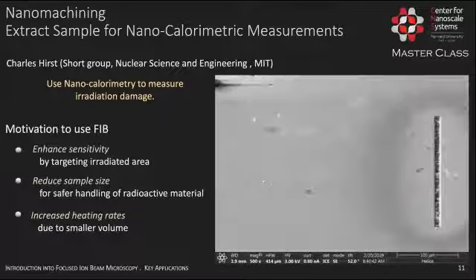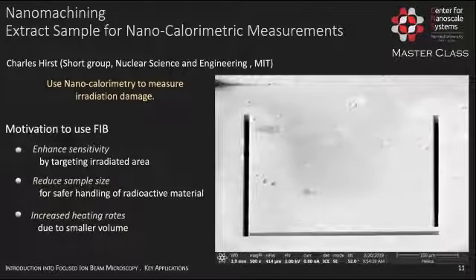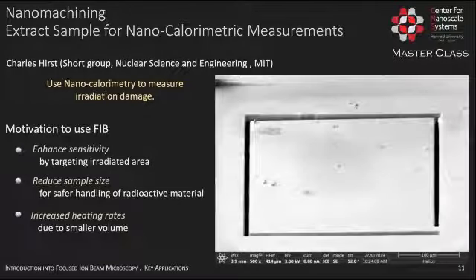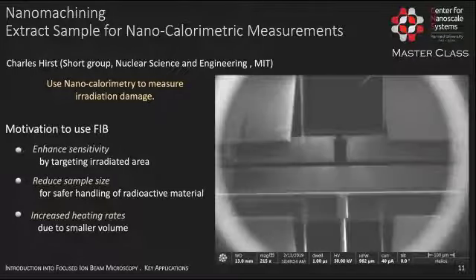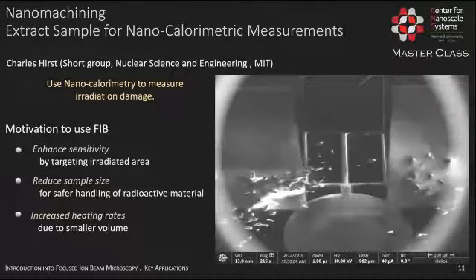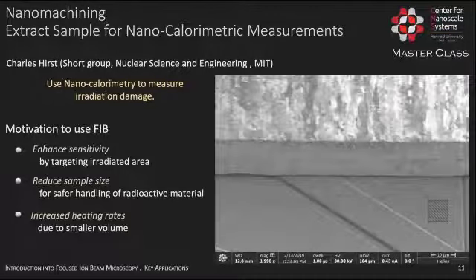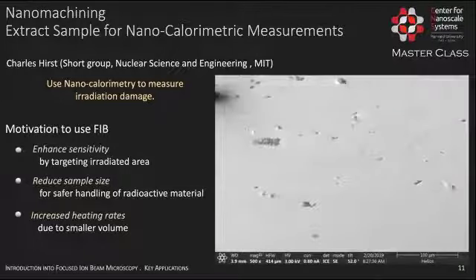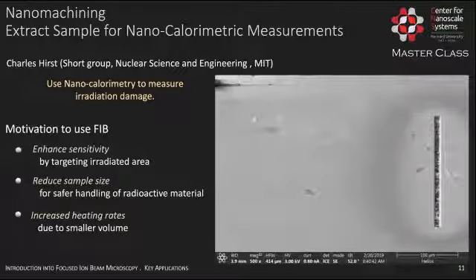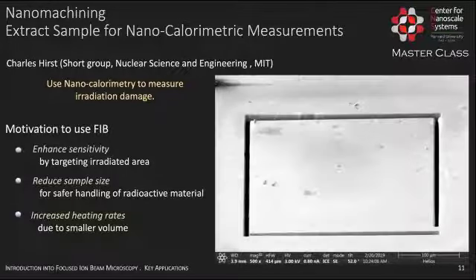Yeah, so we're right now here in the cutting stage. If we are following the movie, you will see that the OmniProbe needle attached to the top is pulling out this rectangle. We move the stage over to a MEMS device. He's dropping the piece and gluing it on with the gas injection system. And you will see in Austin's talk that a very similar process happens when we prepare atom probe samples. So this is just to show you what you can do with these various tools inside of the microscope.